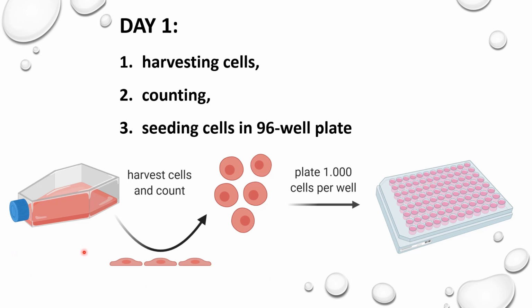So we'll wash the cells with PBS. We add trypsin, which will be a milliliter, cover the surface of the cells and place the flask back into the incubator for roughly 5 minutes in order to detach the cells from the plastic. And once they're detached, we will resuspend them into fresh medium, 10 ml, which also contains fetal calf serum and inhibitors. So the cells are happy in suspension in that tube, but we also stop the trypsin reaction to prevent more damage to the cells.